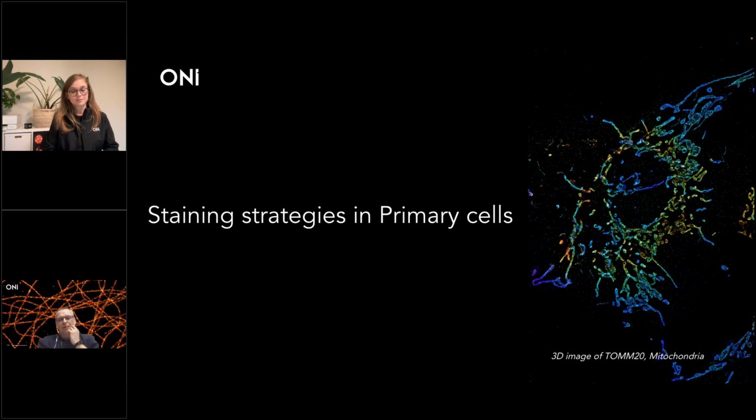Yeah, so that will actually depend on your imaging settings. If you use, for example, single molecule localization microscopy, and you are using, I don't know, the ONI Nanoimager, then we have a separation between the 488 and 560 channel and the 640 channel.